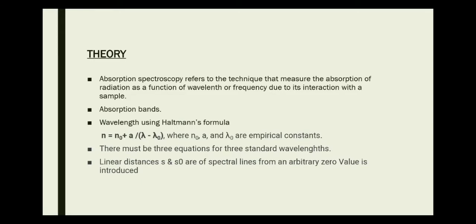When a beam of light is incident on a transparent medium, a part of the incident light is reflected and the rest is transmitted. But certain mediums absorb light strongly corresponding to a particular region of the spectrum and transmit the rest. This is known as selective absorption. The resulting spectrum of transmitted light consists of dark bands called absorption bands.